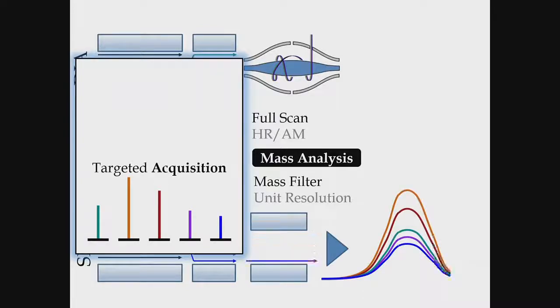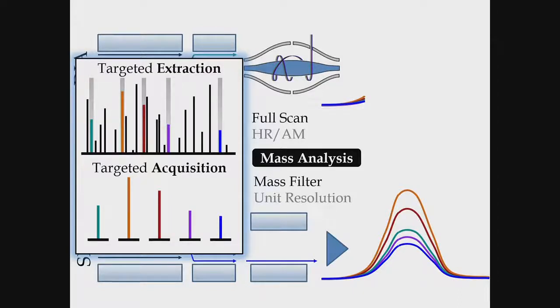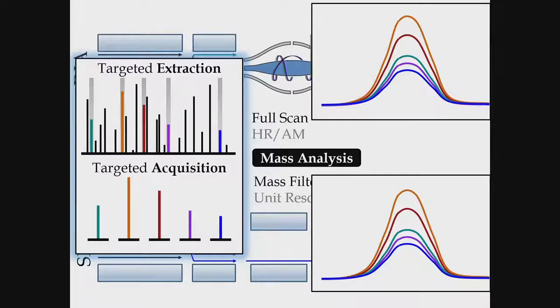But then we go and we obviously reconstruct product ion chromatograms. With an Orbitrap, we collect the entire spectrum at each time. We then do targeted extraction on the data. The obvious advantage, of course, in doing this on an Orbitrap or a time-of-flight instrument is that we collect the entire spectrum all the time. So you can obviously adjust which product ions you extract depending on the actual results of your data. But ultimately, the data looks very similar. So we've always thought about this as being truly a targeted experiment.